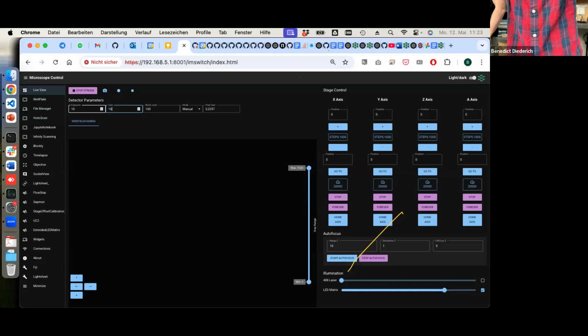Then parallel light goes through a cylindrical lens, where only one surface is bent and the other is not, so it's not symmetrical around the optical axis. The mirror then just transports the light here, and yet another lens projects the light into this little aquarium. Aquarium water, actually, because optics likes flat surfaces. If you look through something that is bent, then optical quality typically degrades.